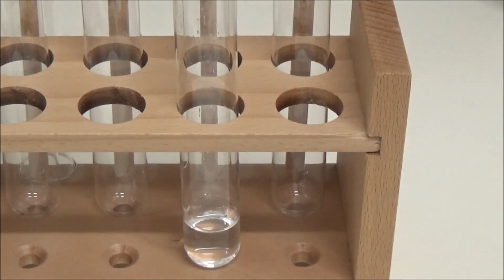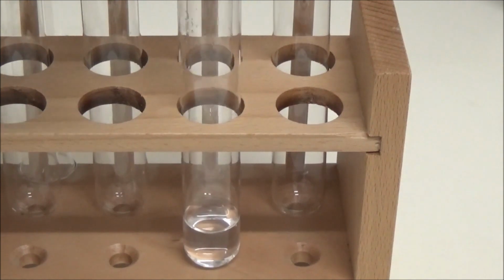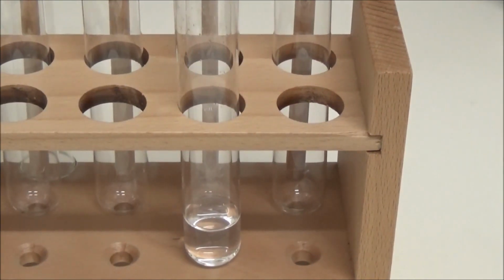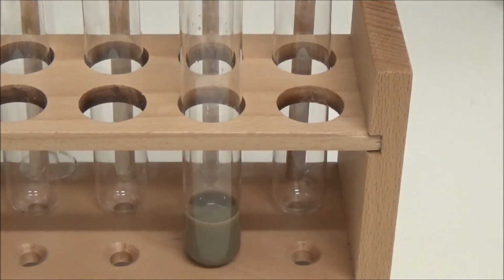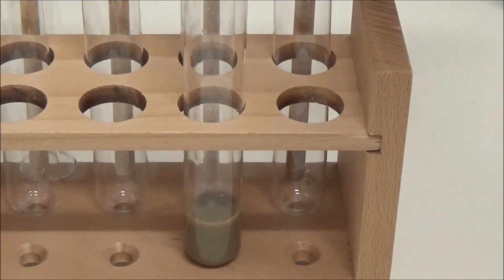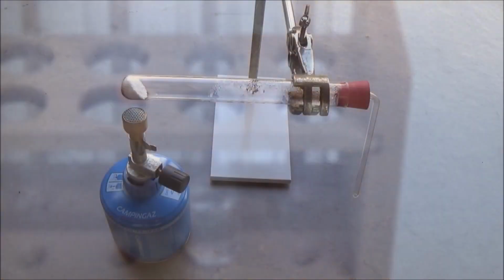To prepare the reagent, a spatula tip of silver nitrate is first dissolved in a few milliliters of distilled water. Then 1 to 2 milliliters of diluted caustic soda are added, whereby silver oxide is precipitated. If about the same amount of diluted ammonia solution is now added, the precipitate dissolves into diamine silver when shaken.